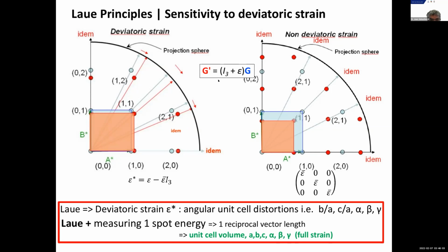If I simulate a two-dimensional crystal, you start from this blue lattice, and as I said, you can predict where the projection will be. So I have computed all the projections there. This will correspond to 3 spots on your detector, for instance.